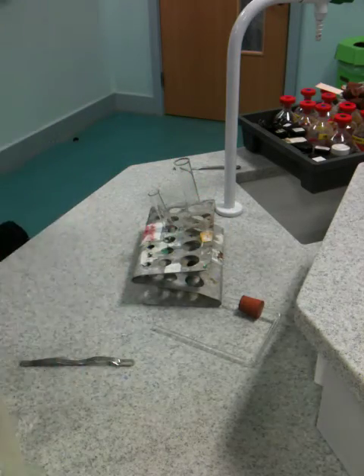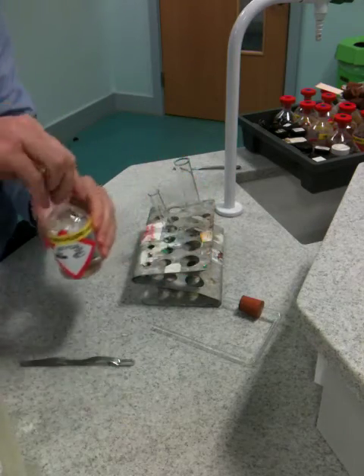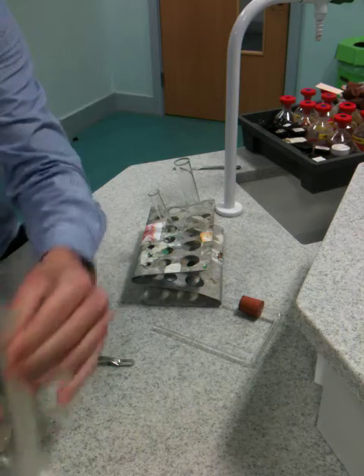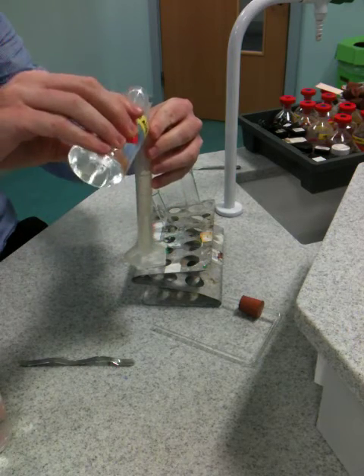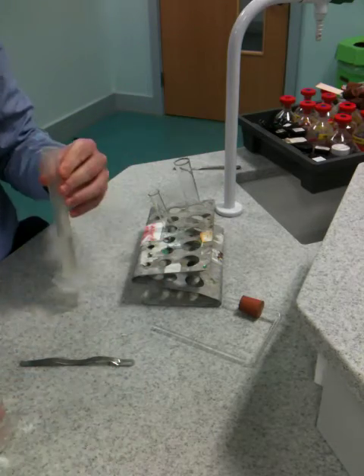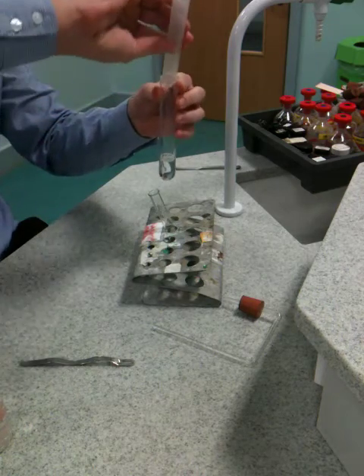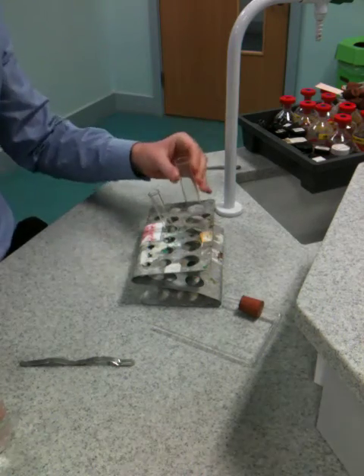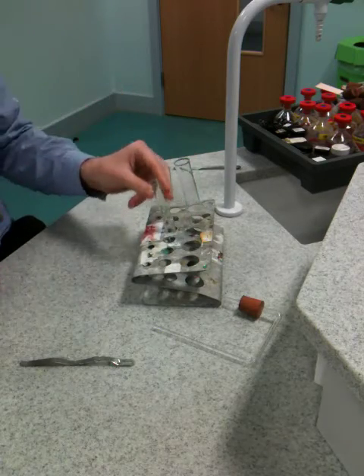We've also got a measuring cylinder. So what we're going to do is put hydrochloric acid into the boiling tube — measure out 10 millilitres, 10 centimetres cubed, of hydrochloric acid. Always put the stopper back in the bottle, and that goes into our boiling tube like so.